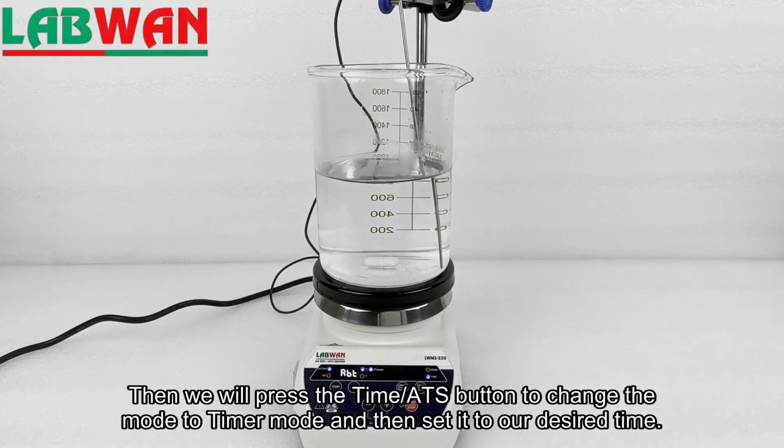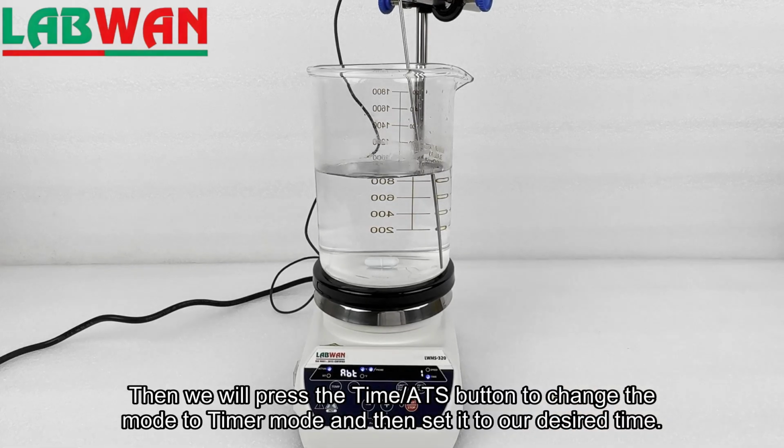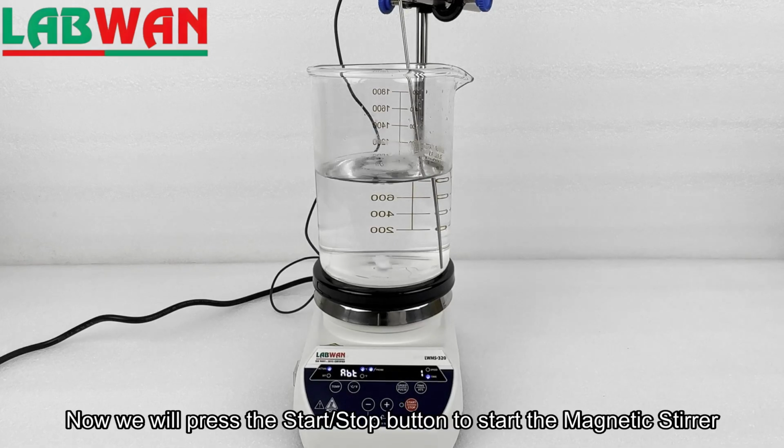Then we will press the time, ATS button to change the mode to timer mode and then set it to our desired time. Now we will press the start, stop button to start the magnetic stirrer.